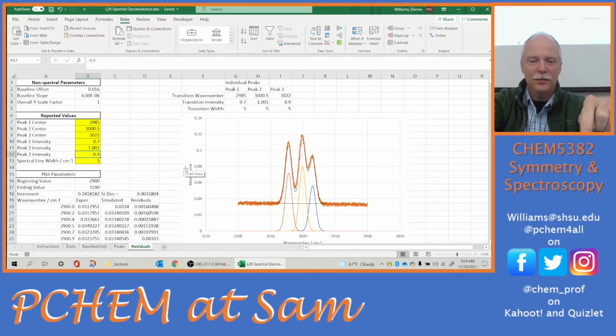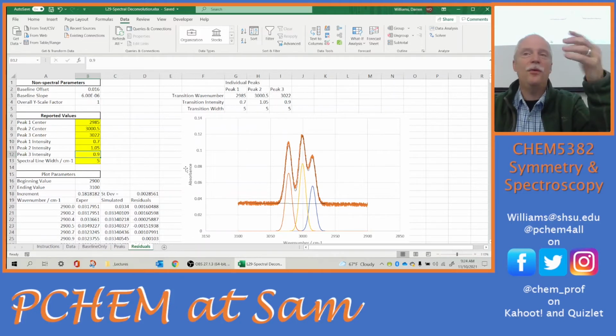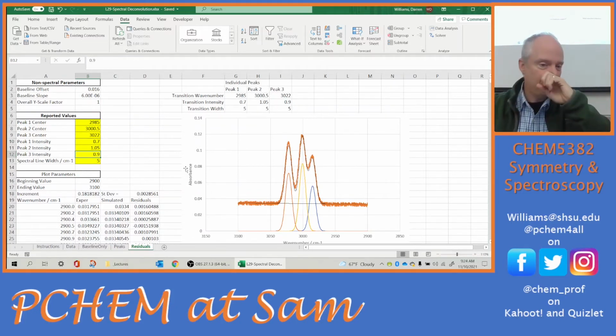It went down a little bit. Okay. You delete one of the zeros. 1.01, 1.05. Okay, let's try 1.1. It went too high. 1.05. Okay, let's go back. Yeah, so we want a lower standard deviation and it dropped now. It's 0.0028. Okay, so this is good.